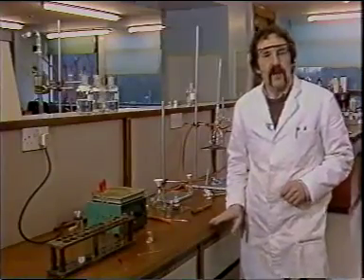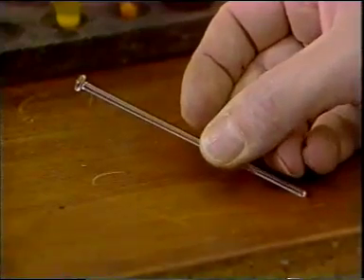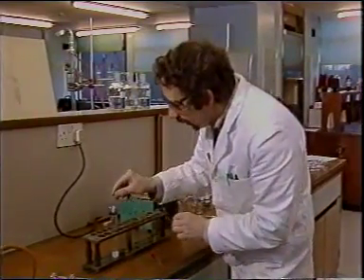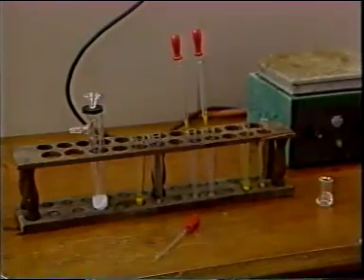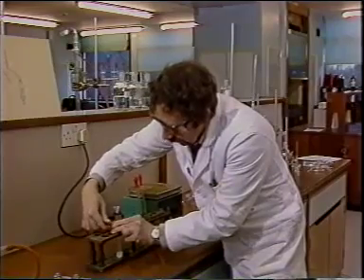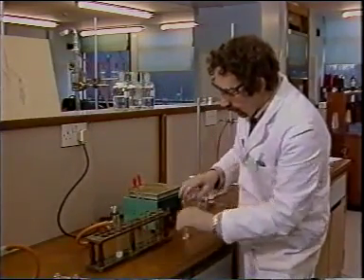For slightly larger quantities of solid, this glass nail, the Willstätter nail, can be used. It fits snugly inside this glass filter funnel, and we can use a sidearm tube in which the cone tube inside rests on cotton wool.